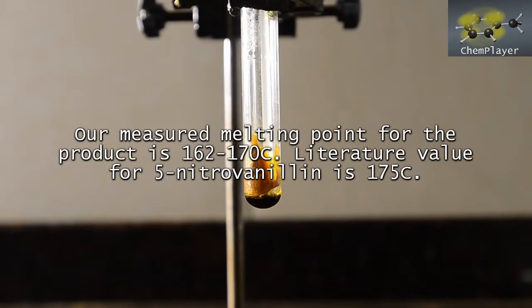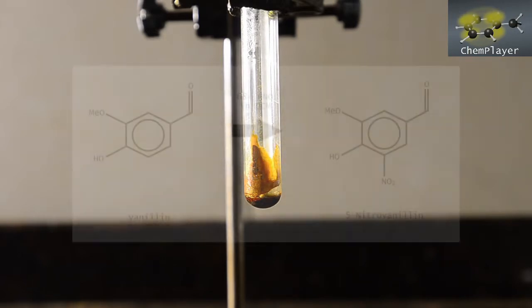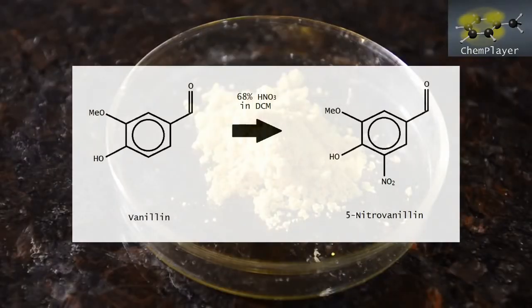The literature value for 5-nitrovanillin is around 175 degrees C. So it's really not far off. So we're going to tentatively assume that that's what we've got as a recrystallized product. We've got about 5 to 6 grams from the various attempts we made, so enough for some follow-up reactions. And we'll keep experimenting to see if there's a solvent which works better for recrystallization. So this is a reasonable process.